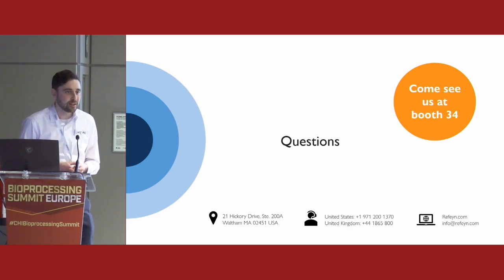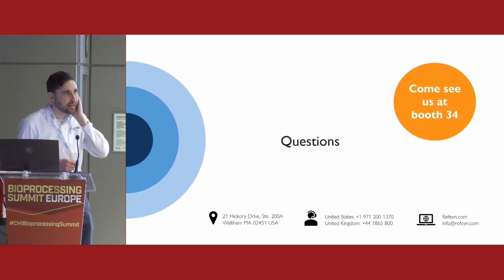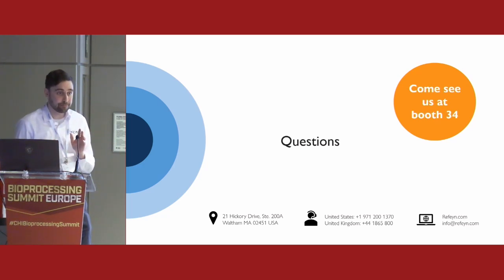And is that in native solution? Say if the mAb is conjugated with some other chemicals non-covalently, can you measure the mass difference without interrupting the interaction? Yes, but it would depend on the mass difference. For an antibody, you would need a mass difference of probably around 30 kilodaltons to be able to resolve that on the mass photometer.